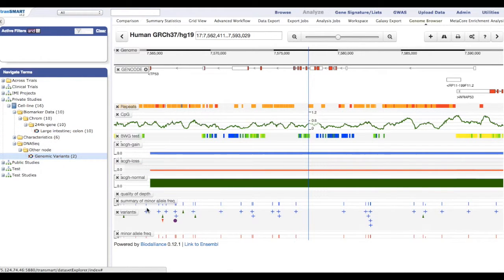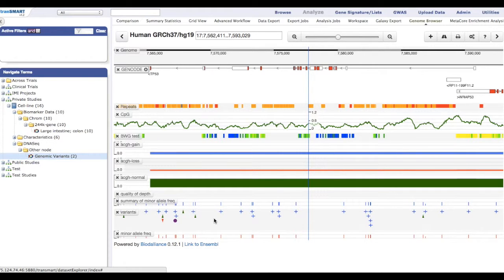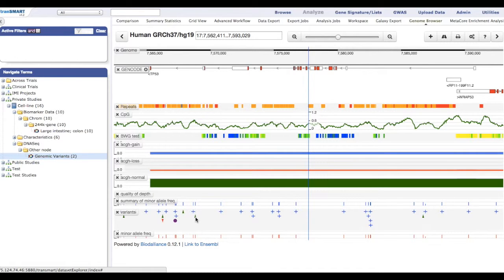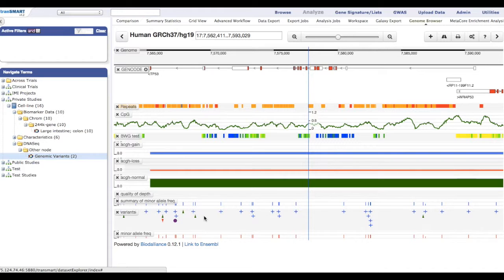Genomic variants, SNPs, unidentified mutations, insertions, and deletions are displayed in the browser using different icons. For example, an upward green arrow is an insertion, and a downward red arrow is a deletion.